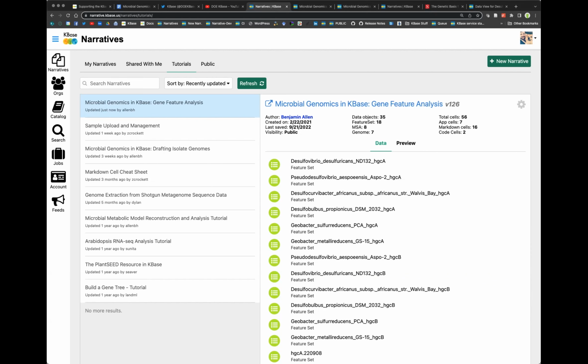So what we're talking about on today's webinar is continuing the theme from the last webinar, which is doing the basic processes and protocols for microbial genomics using the tools that we have on KBase. The last time we discussed this, we looked at drafting isolate genomes.